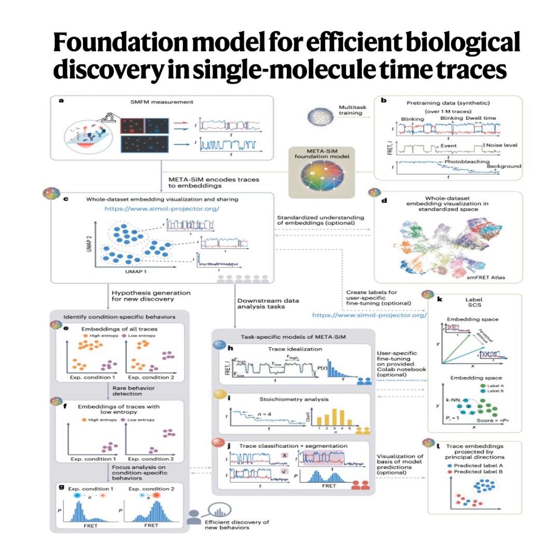Okay, so you need something better, something faster, more objective, and that's where the focus of our source material comes in. META-SiM. Right, META-SiM. It stands for Multitask-Enabled Transferable Attention Model Neural Network. Quite a mouthful. Yeah, it is. But the core idea is that it's a foundation model designed specifically for these single molecule traces. So our mission today is to unpack how META-SiM can act as a shortcut to more systematic and accelerated biological discovery.